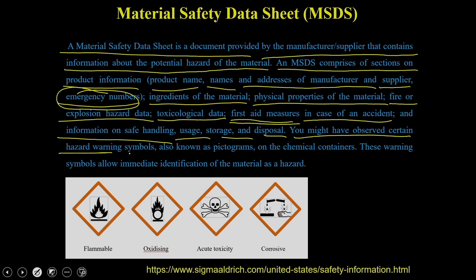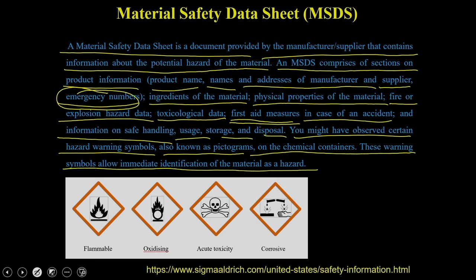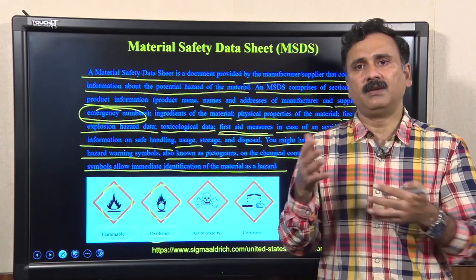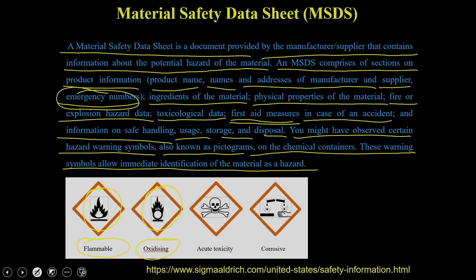You might have observed certain hazard warning symbols, also known as pictograms, on chemical containers. These symbols allow immediate identification of a material as a hazard. For example, a flame symbol means the material is inflammable — it will catch fire very soon, so keep it away from fire when using. A similar symbol indicates an oxidizing material, such as bleach, which can cause injury to your skin. Another symbol indicates a very toxic material — a poison or life-threatening substance — meaning its LD50 is very low.